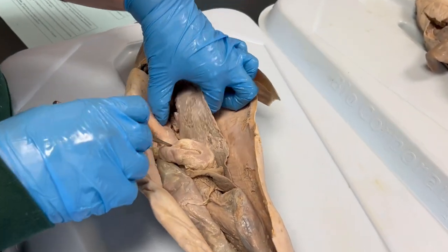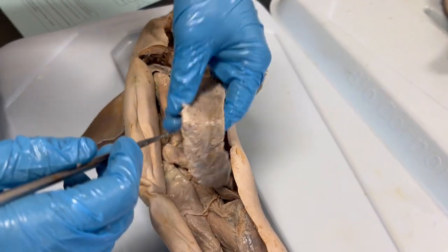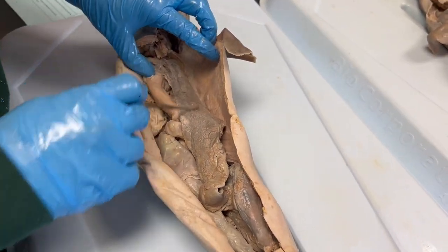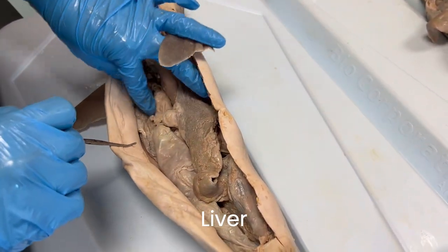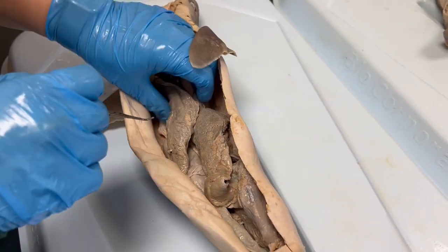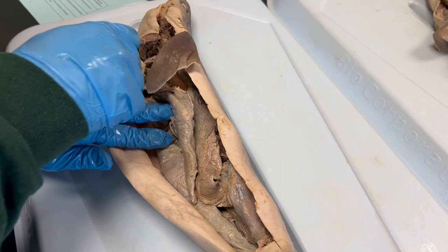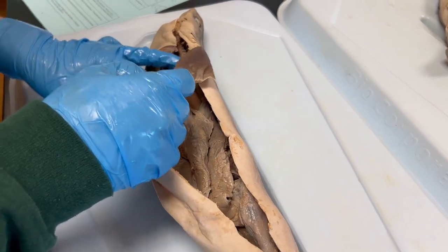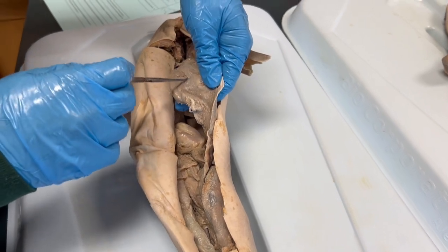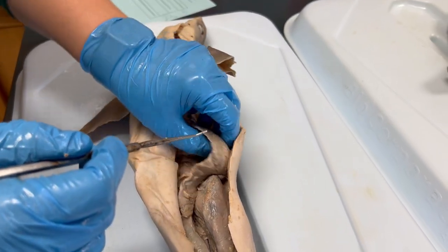Now on to some of the accessory organs of the digestive system — the ones that aren't in the actual digestive tract itself. First we have the liver. The liver of the shark is extremely large and oily. It is responsible for producing bile to help break down fats in the food they eat. It also detoxifies blood and produces a rather large amount of oil.